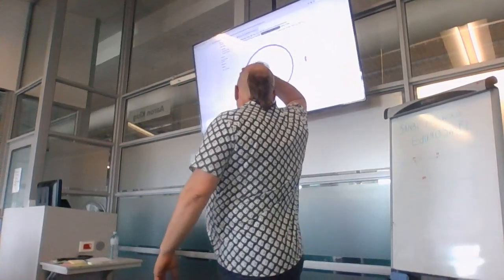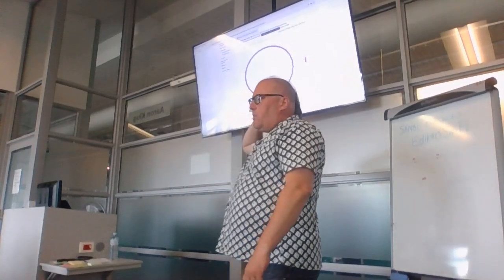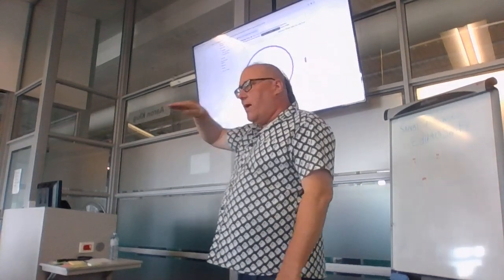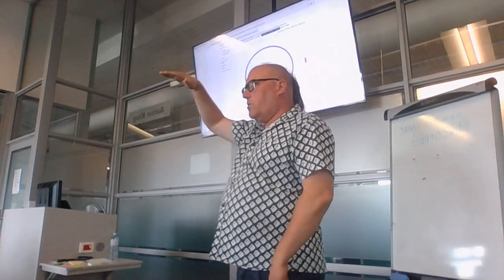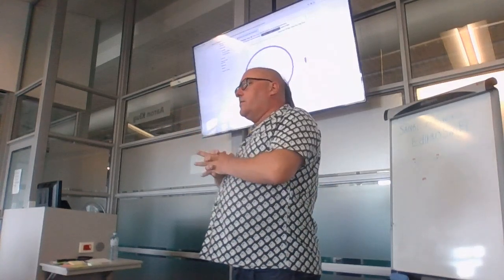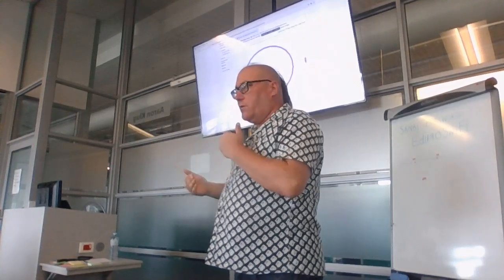Ryan and co just came up with a new assessment. They also said that you must have at least 25 read coverage on a position to trust polishing. If you've got less than 25 reads coverage, you can actually introduce errors in the polishing.